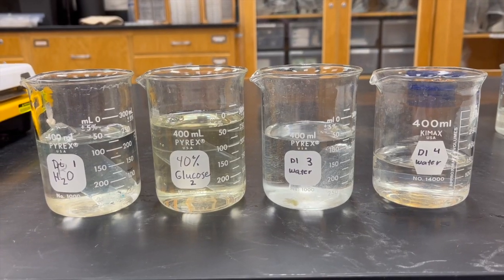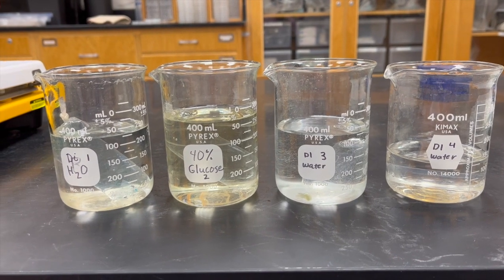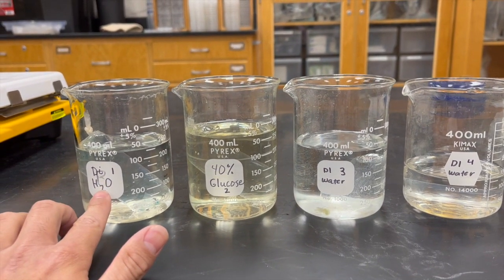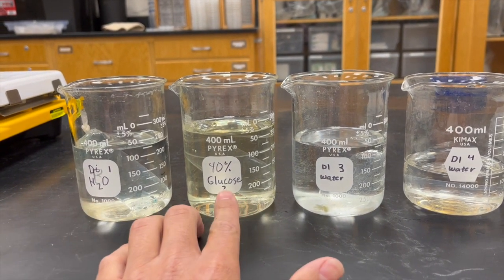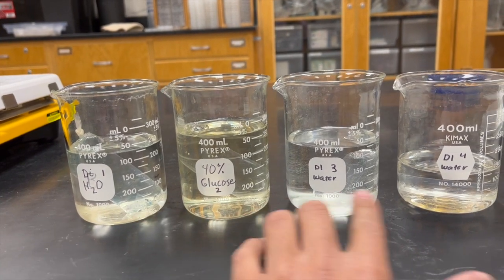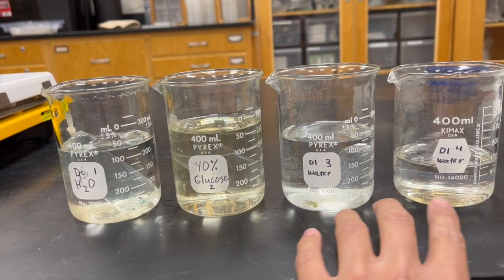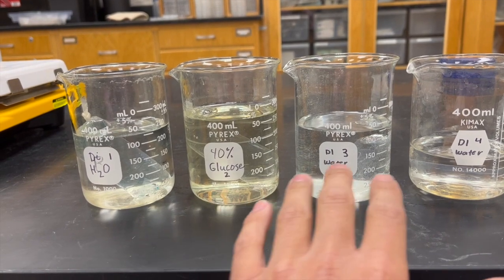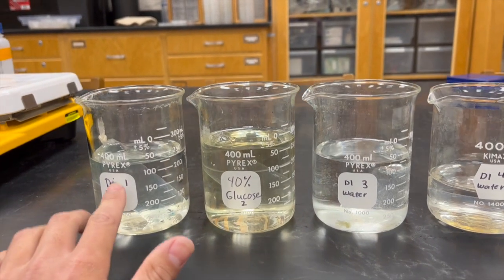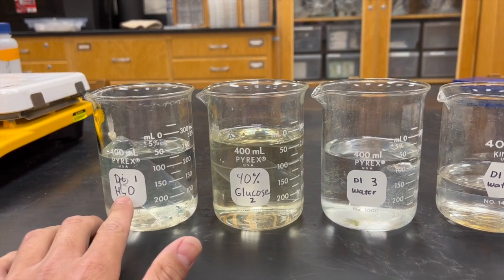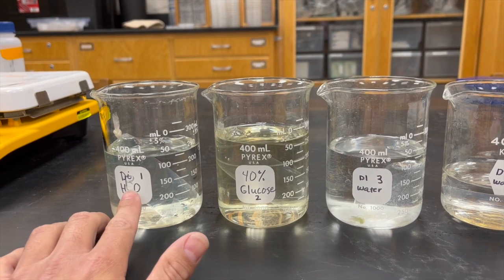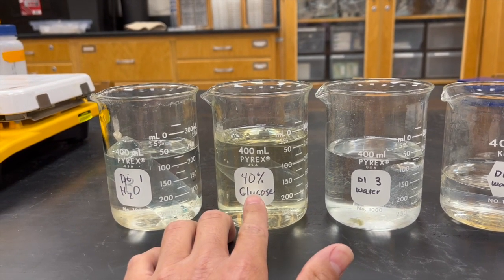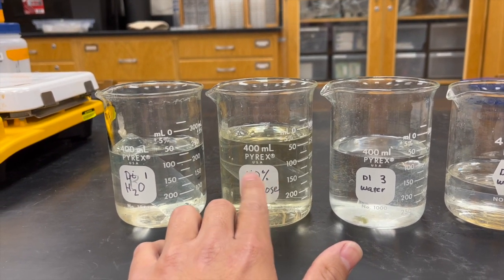Now we have our four different beakers with different solutions. The first beaker has DI water, this one has 40% glucose, and both of these are just DI water. For tube one, the dialysis bag has 40% glucose. For tube two, we have 40% glucose in the dialysis bag as well.